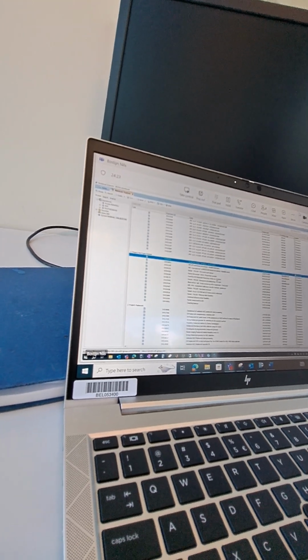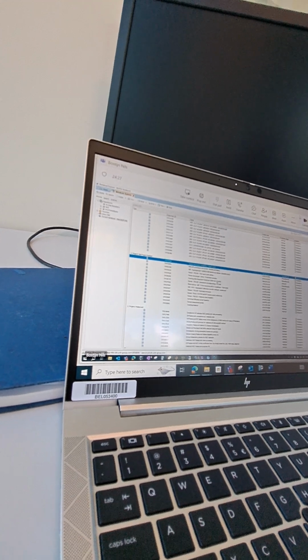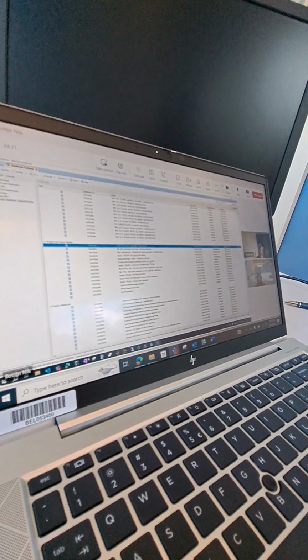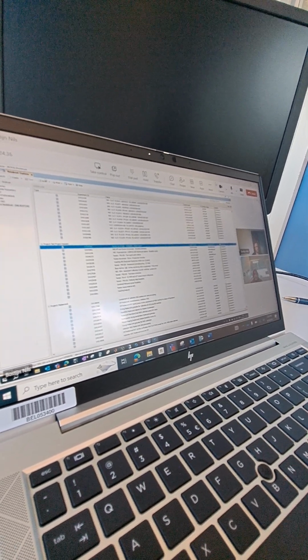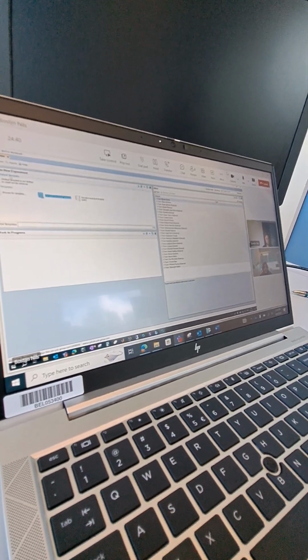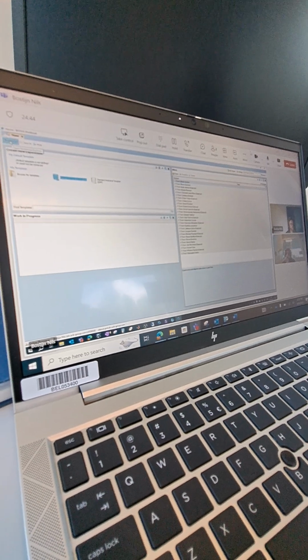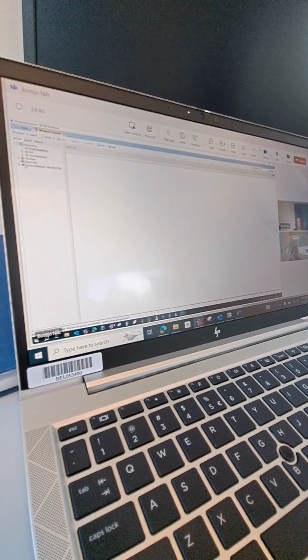So now I explained a bit what you have within one ELN, and now I'll explain a bit how you can search for other ELNs of other persons, and also a bit how it looks. So when I go back to the starting page, you can click here on Explorer on the left top, and then this will open.